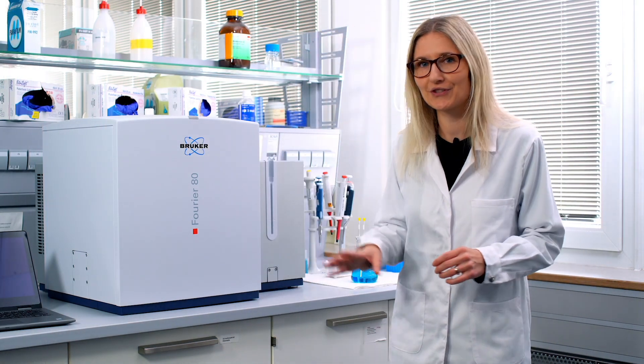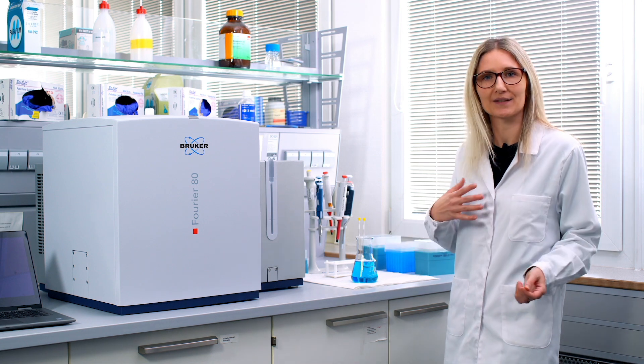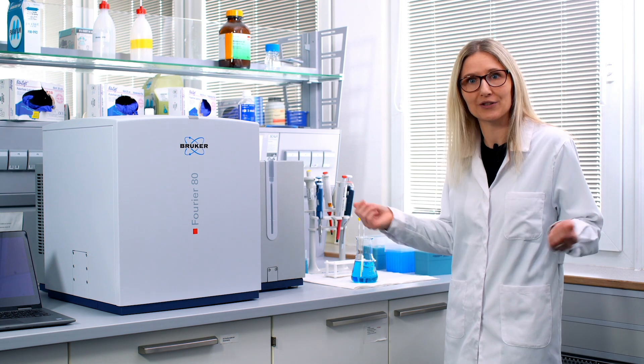Maybe you know the situation. You have just finished your synthesis and you need to quickly check your intermediates or your products and NMR would actually do the job for you. However, either you have no access to an NMR spectrometer or you need to queue up and then you most likely can forget about this quick answer.